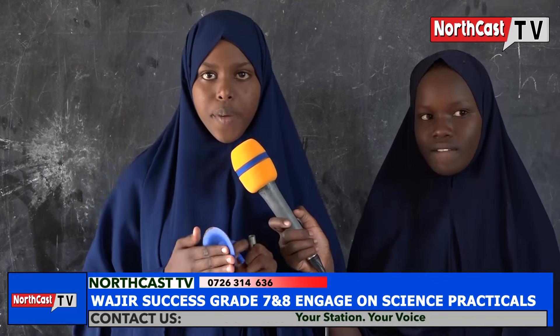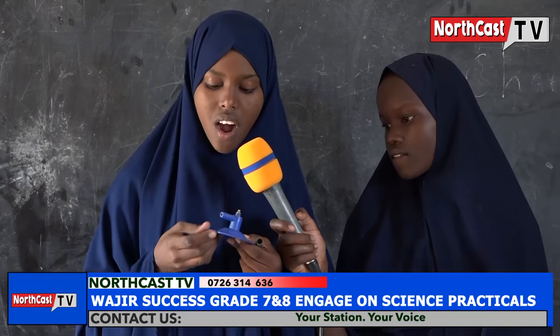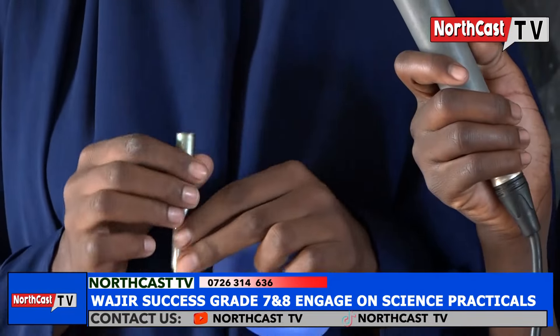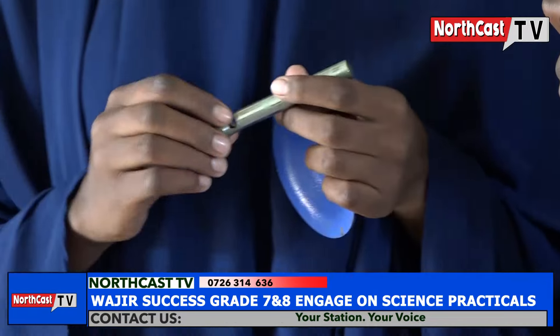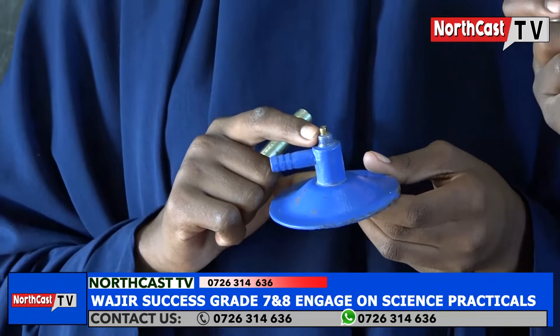We have a base — it is used to keep the Bunsen burner stable on the bench. We have rubber tubing — this connects the gas inlet of the Bunsen burner to the gas tap. We have an air hole — it allows air to enter the chimney. We have a collar — it is used to open or close the air hole. We have a jet — it allows laboratory gas into the chimney.